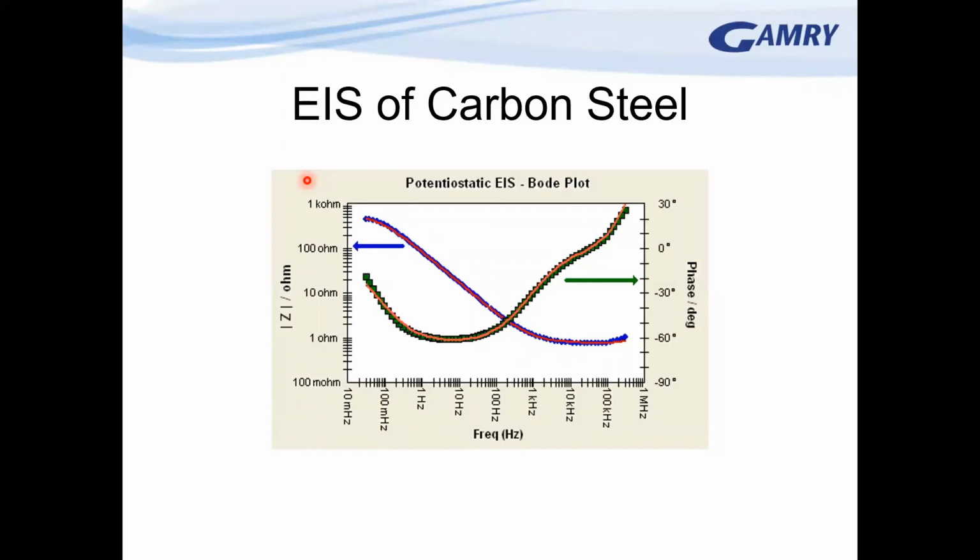Okay, I have another question. This is about polarization resistance. For the calculation of RP from an LPR measurement, is it correct to consider a linear part of the IE curve which is not at the origin but just a little bit after? In this example, some measurements in biological fluids result in a curve that begins to be linear right after zero current.